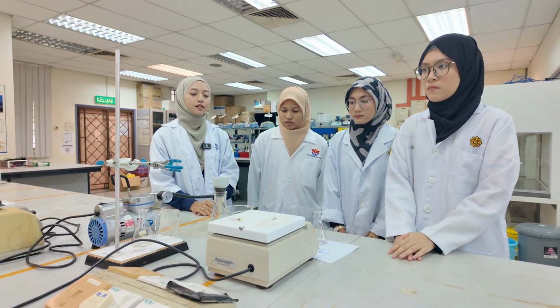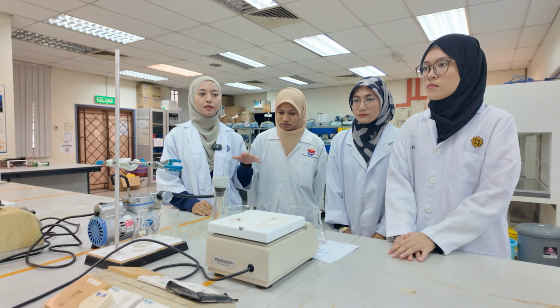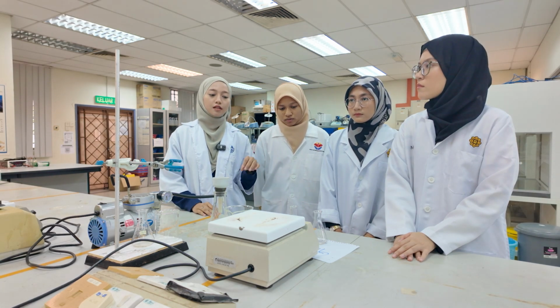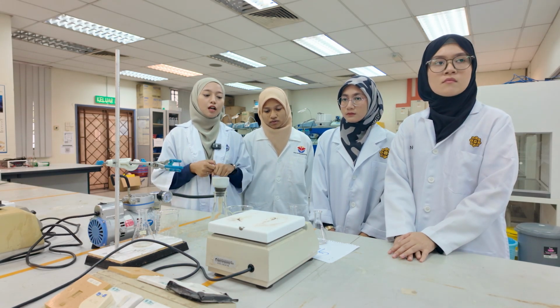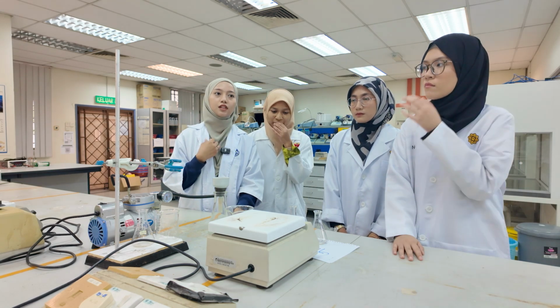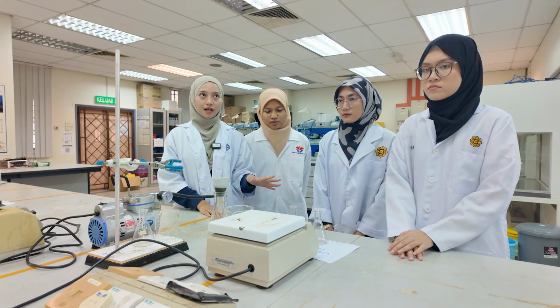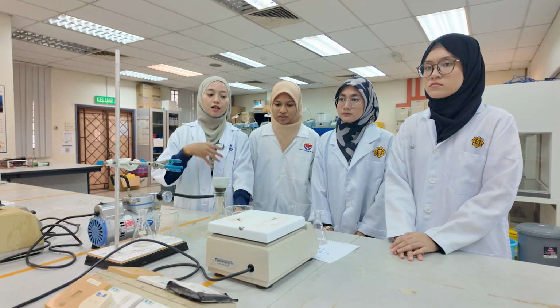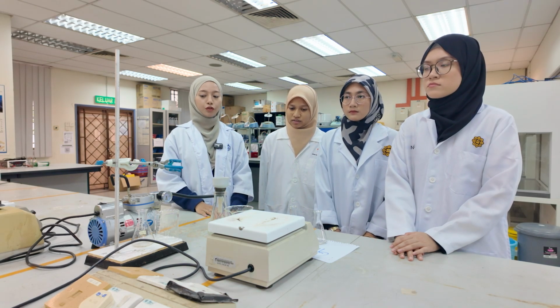The next one is ventilation. We need to handle this experiment in a well-ventilated fume hood, because some of the methanol and hexane might release harmful vapor which will affect our breathing, and the fume hood will minimize the release of the vapor. The next one is vacuum filtration.